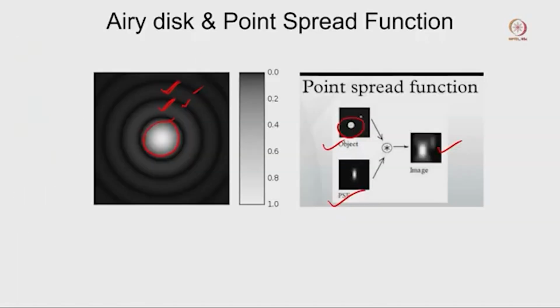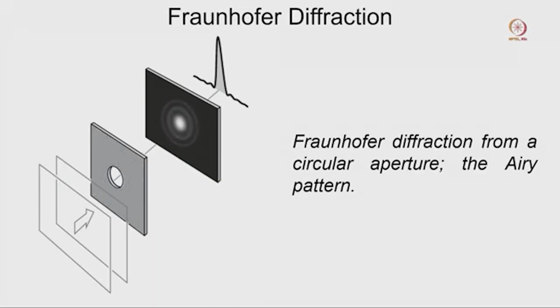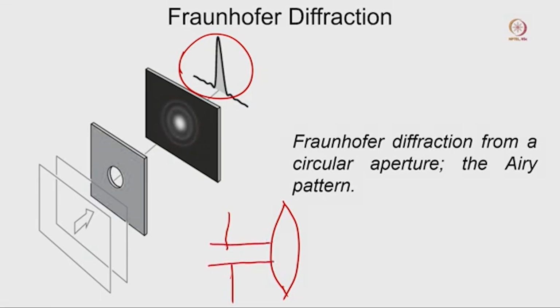Now we want to discuss a little bit more about how we get those kinds of curvatures. Suppose we have a pinhole somewhere here, or an opening, and there is a light source with light coming from different positions. We have a source here, and light rays come from this particular source as straight light. This is the image plane, where we can see that these rays go and form an image here.